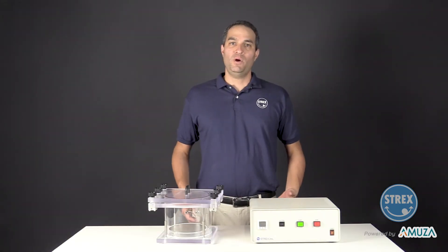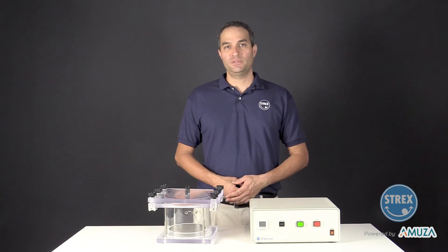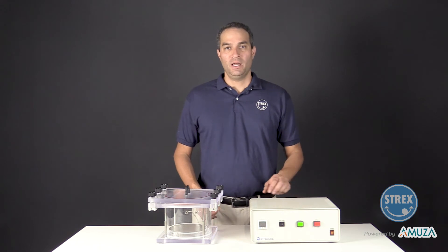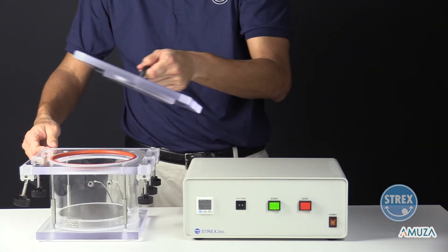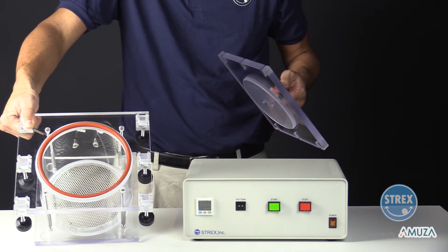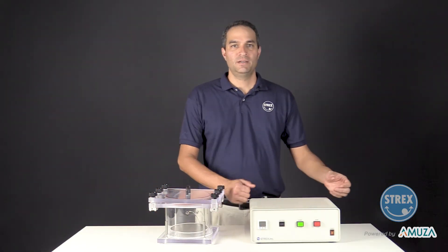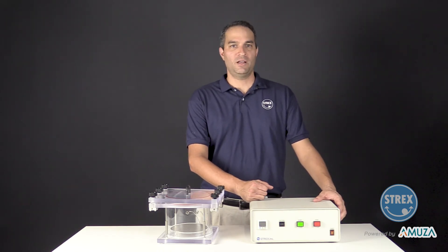The AGP-1000 system can be run in either continuous or cyclic mode. The system includes a pressure chamber, control box, regulator, and vacuum tubes that are required. The pressure chamber is designed to be placed inside an incubator. The program is fully automated for gas exchange at given intervals to ensure cell viability.